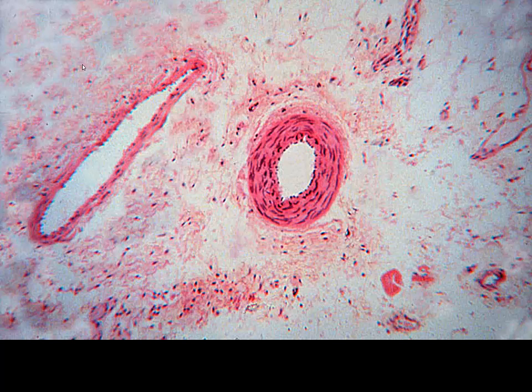Now here we have a different section through the tissue, and these are the smaller vessels, and we know they're smaller and the luminal diameter is different because it's easy to look at the nuclei. Here we can see the nuclei. There are not nearly as many of these in this one as we saw in the previous image, so this one is much smaller, as is the diameter of this vessel.